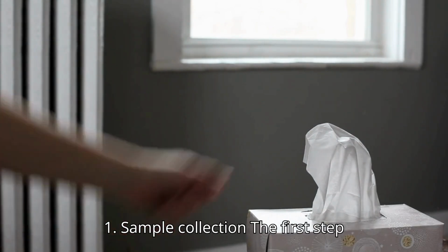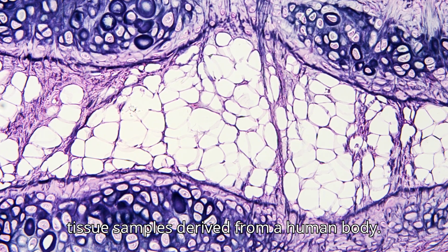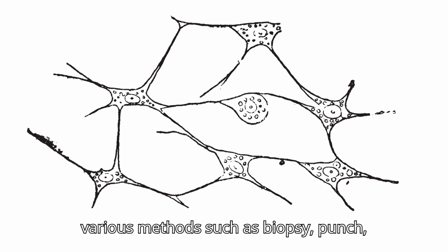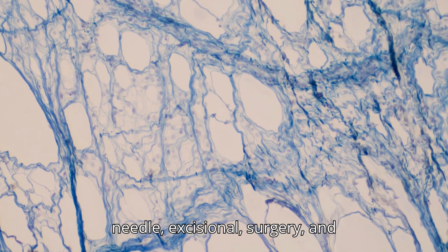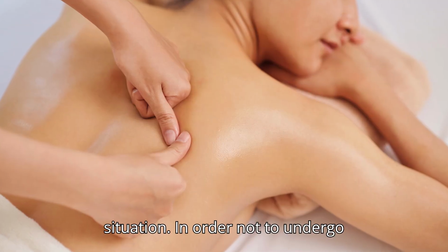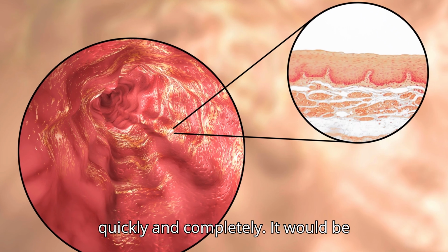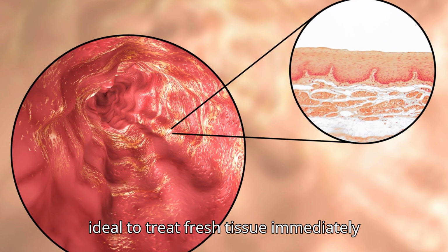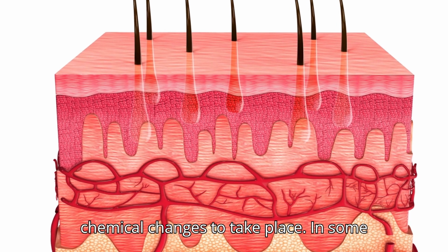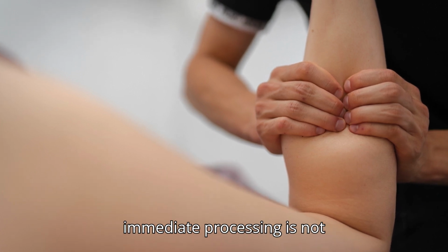Point 1. Sample collection. The first step in tissue preparation is obtaining tissue samples from a human body. Tissue samples can be obtained through various methods such as biopsy, punch, needle, excisional, surgery, and autopsy, depending upon the clinical situation. In order not to undergo decay, tissues have to be obtained quickly and completely. It would be ideal to treat fresh tissue immediately so as not to allow morphological or chemical changes to take place.